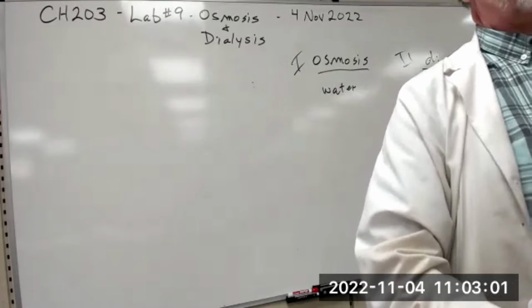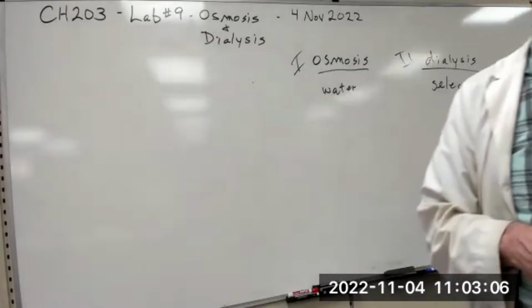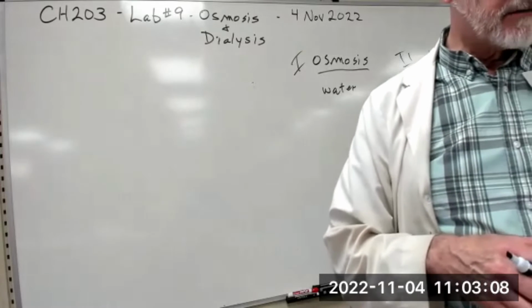Okay, so Prelab. Tell me how to make a 0.9% sodium chloride solution.